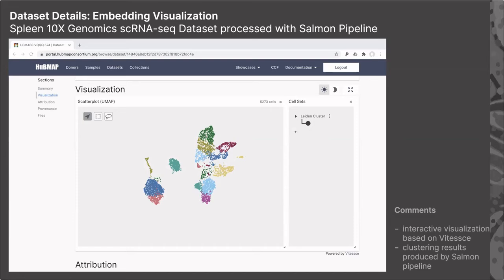And in this case, I didn't even expand this out because the clustering that the pipeline does will simply assign cells to individual clusters, name the clusters like 0 through X, where X is the number of clusters, and that's it. So that is not particularly informative, but nonetheless, we provide this information right here and display it, and you can explore. You'll see this in a moment, how that will look like.